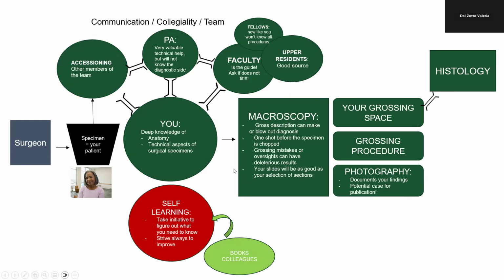Macroscopy: your duty during the gross room is going to be to perform the macroscopy of the specimen, or what we call, inappropriately, the gross of the specimen, but the proper name is macroscopy. You are going to perform the gross description and take the appropriate sections. So make sure that you know what you are doing before you cut a specimen. The gross description can make or break a diagnosis.